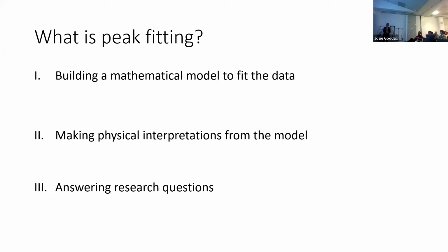I promised I would say what peak fitting is. I think all of you know, but let's set it out. Peak fitting, of course, isn't unique to XPS. It's part of lots of different data analysis workflows. Step one is building a mathematical model to fit the data. Step two is making physical interpretations from that model, and then you interpret it.